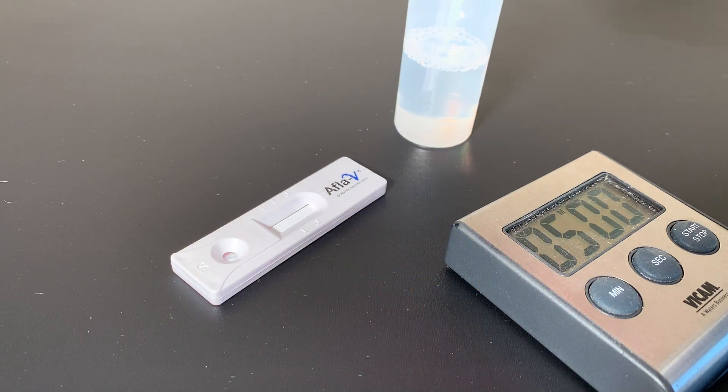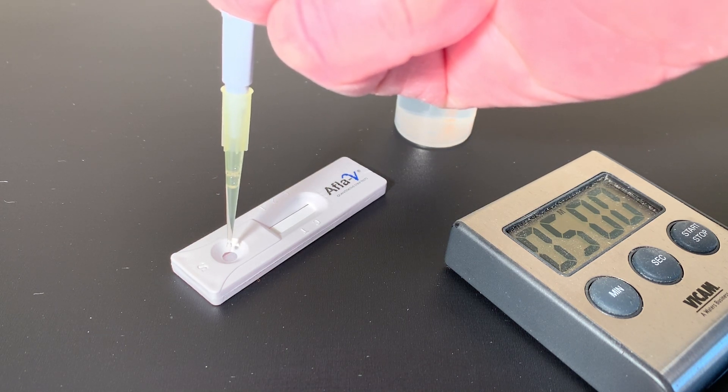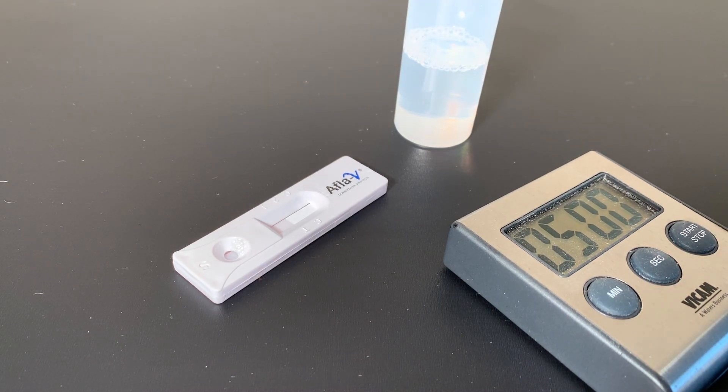For aflatoxin, ocratoxin, fumonisin, and zearalenone, pipette 100 microliters of extract to the sample well on the strip at 1 drop per second. Place the strip on a flat surface for five minutes. If you wait 30 seconds between each test strip, you can finish the tests in rapid succession.